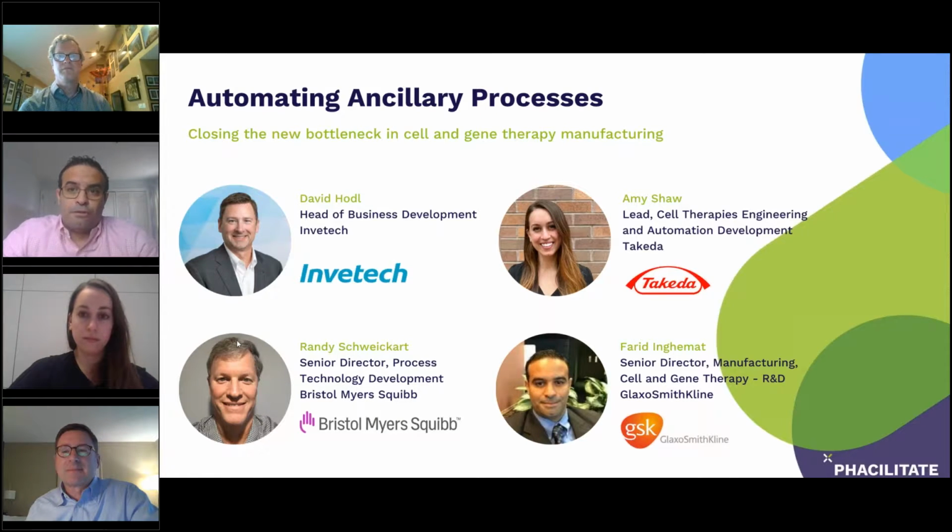Yeah, so from a process aspect, it's extremely important to have systems, equipment, and materials that are amenable to maintaining closure of that process, including sampling. Just to share an example, and I'm sure a lot of people are struggling with this in the autologous cell and gene therapy space, where the turnaround time is extremely important. A lot of people are moving to BACT testing for sterility.